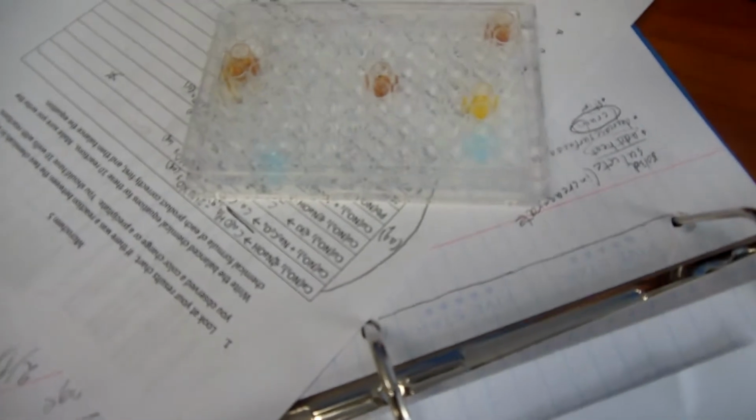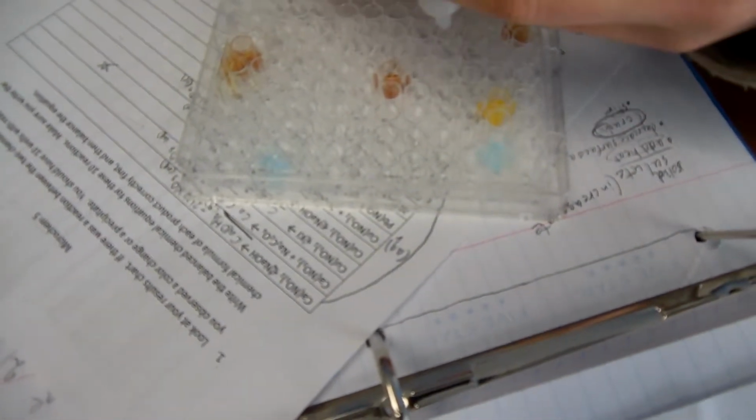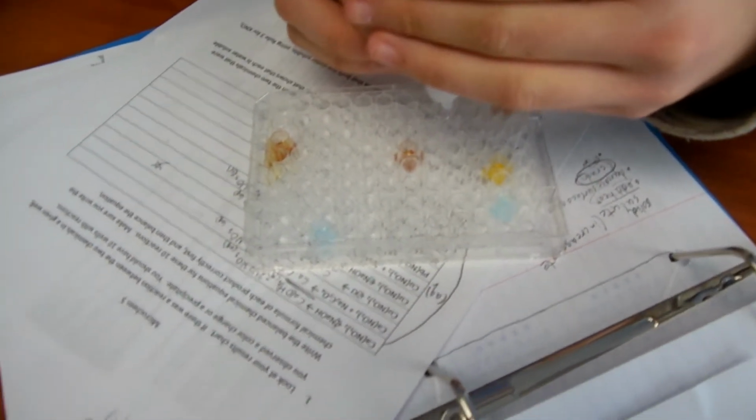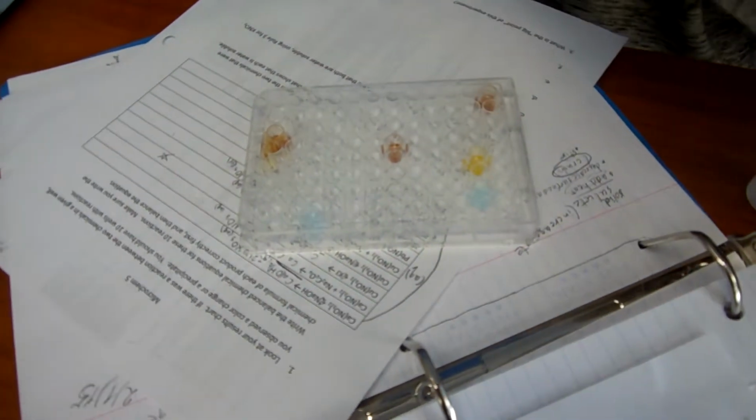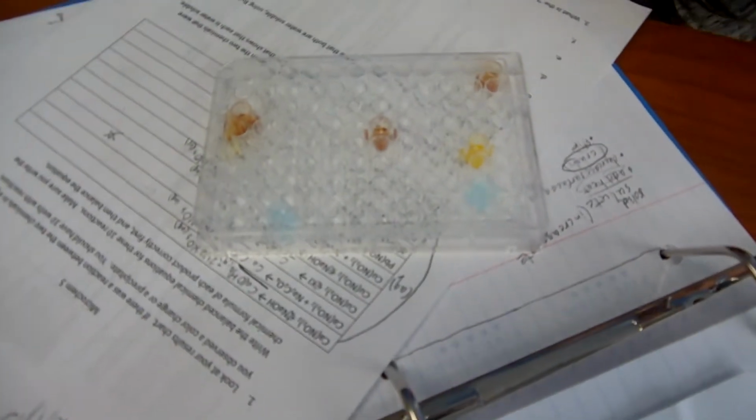So pick an empty well that doesn't look contaminated. I'm just throwing out this well plate. Now you can buy like 6 well plates on Amazon, but a few years ago you really couldn't. You just had to buy them by 300s at a time.